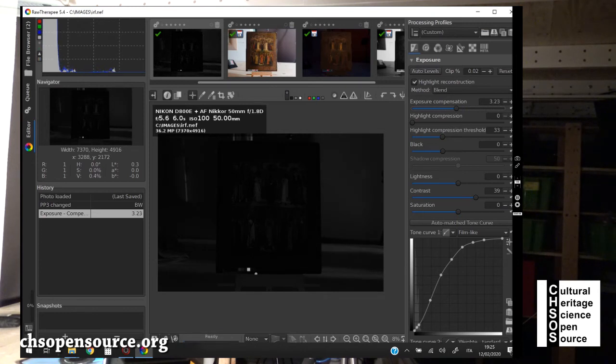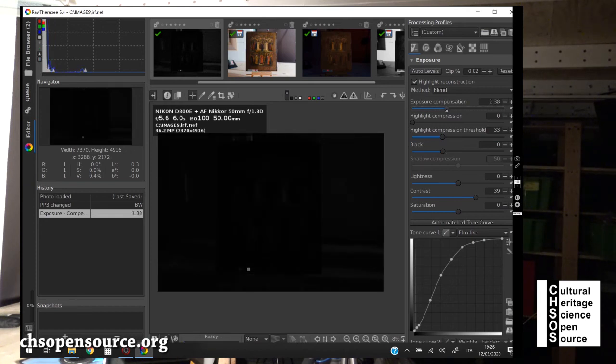The spot that you see here on the bottom is the cadmium red swatch. Cadmium red has this phenomenon that when it receives visible light, cadmium red emits infrared. So basically it's put over there in the calibration card in order to have a reference. So what we do is actually we now reduce again the exposure, so that you see, we just see here cadmium red. So the concept is that if there is any cadmium red in the painting, it's going to have the same brightness of the swatch of cadmium red over there.